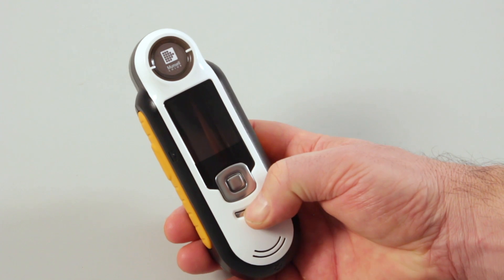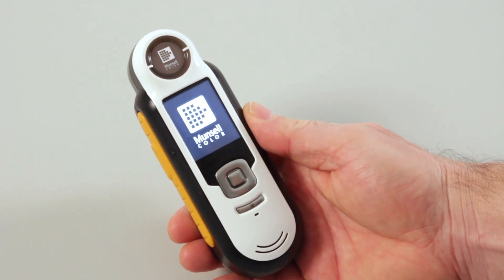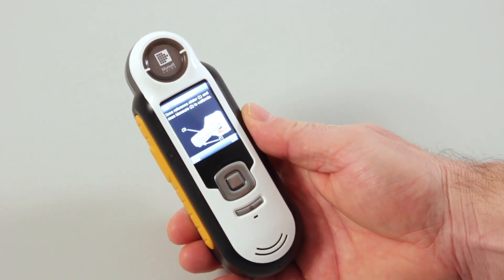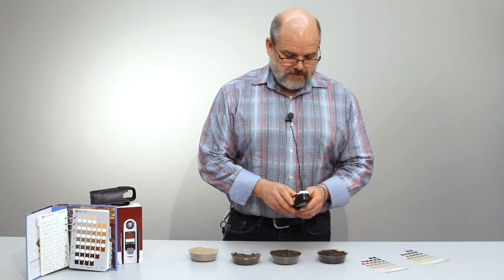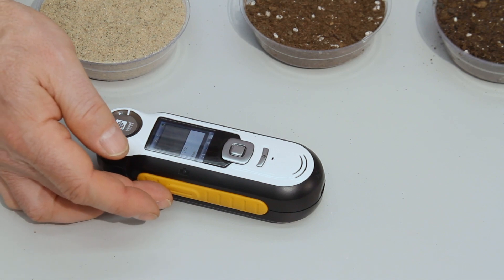First thing we would do is turn it on, and then we would go through and do our calibration of the device — sliding the calibration up, press click, and the button is right on the side to trigger it.